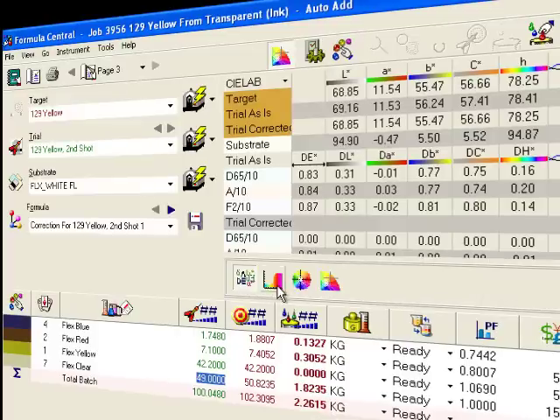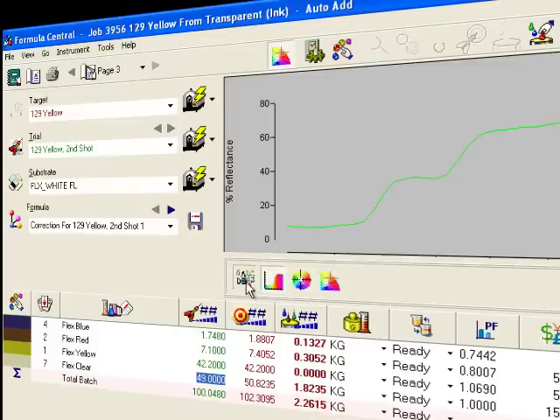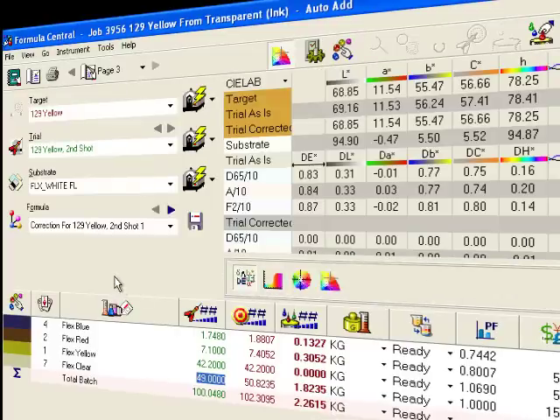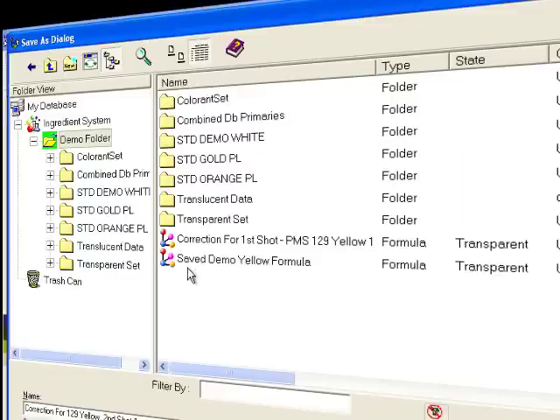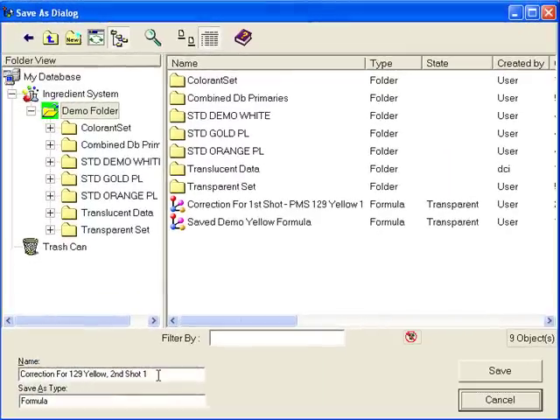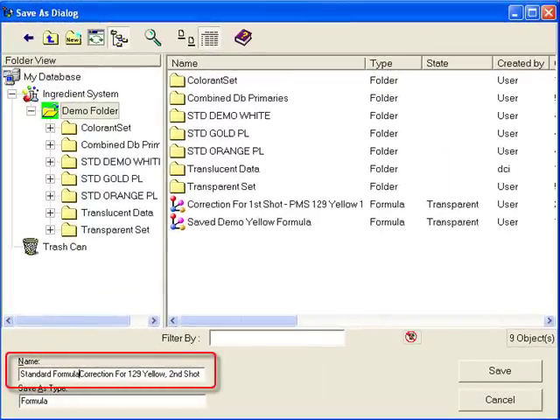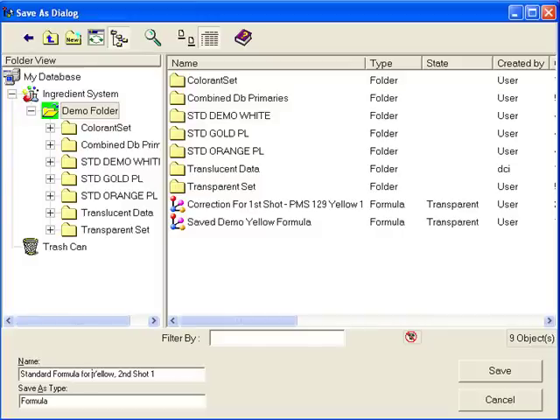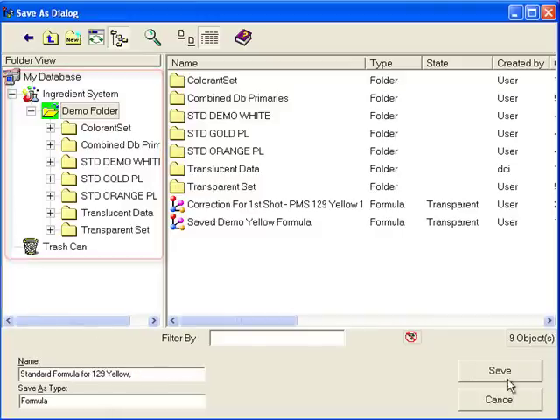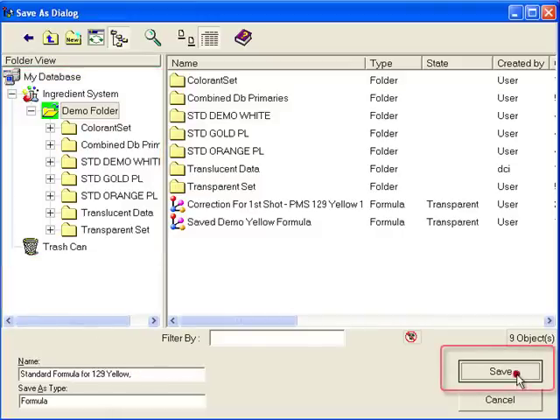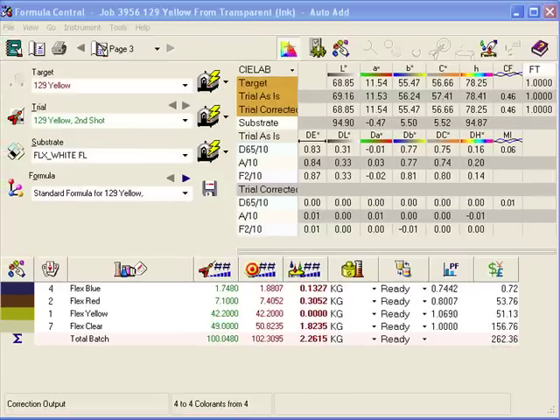Once I have an acceptable color match, I'll save the formula. Click this button. Give the sample a name. I can pick any folder that I like. And then click the save button. With the standard formula safely stored for later use, our work matching this color is complete.